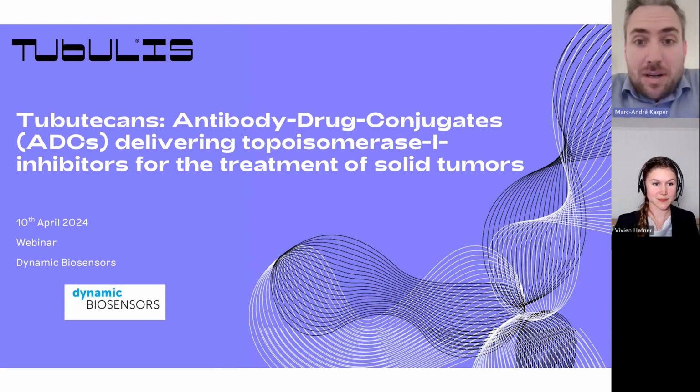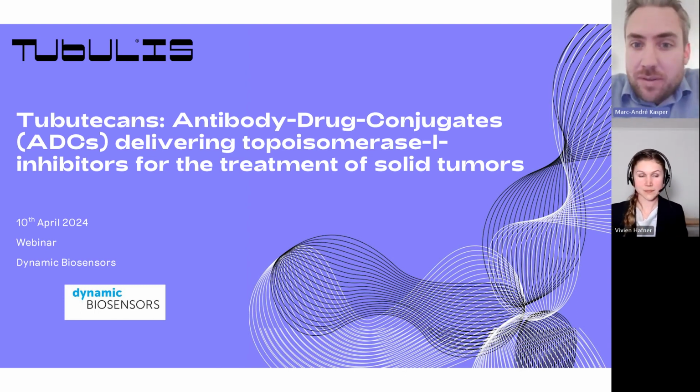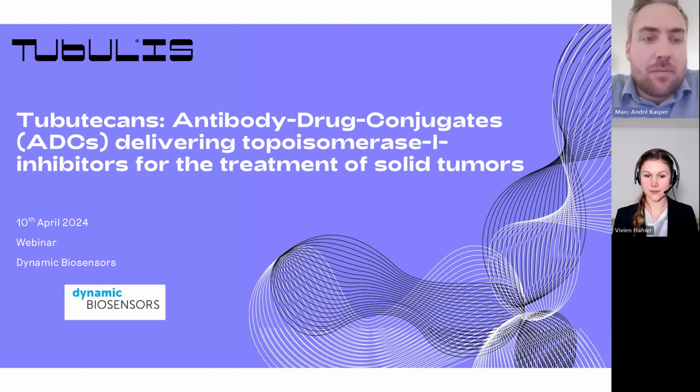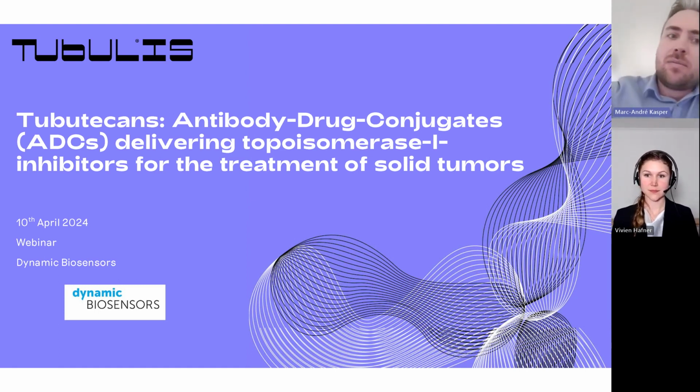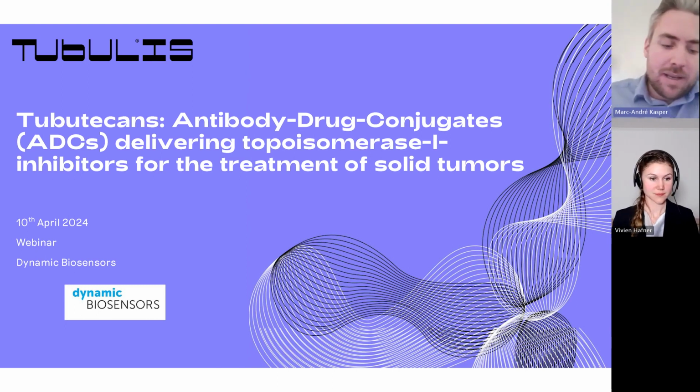Today, I would like to talk about how we leverage topoisomerase 1 inhibitors for the treatment of cancers with a very interesting modality, which I would like to explain in a second, which we use, which is antibody drug conjugates. And I would also like to discuss how we use the technologies that were just introduced to biophysically characterize our molecules to be ready to apply them in the patient and get all the sufficient data.